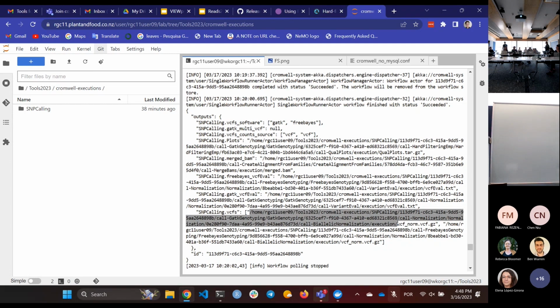One other thing: it's very good, but I didn't show it, but I have a tutorial on how to connect a MySQL database to the workflow. So if something like that happens, like the last task of your workflow fails, you already have a database. So if you run again, you don't run all the rest. You just run the one that fails. And this is very useful.